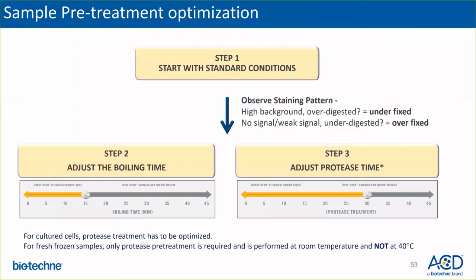Okay, so let's get started again. Moving on to the next step, which is the sample pretreatment optimization.